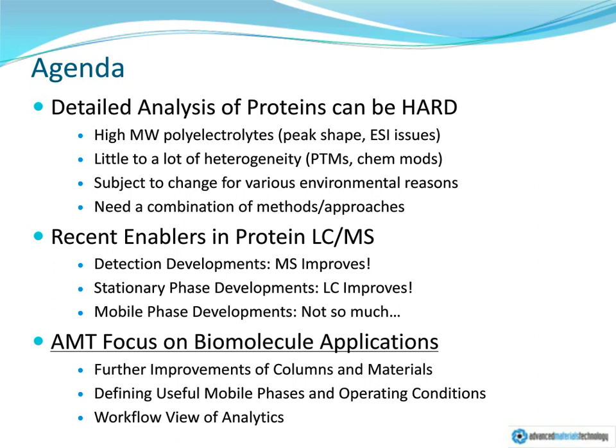But we have spent quite a bit of time and resource finding useful conditions or trying to expand the useful conditions for conducting separations for proteins and for peptides, as well as nucleic acids. We have, over time, developed more of a workflow view of protein bioanalytics, and we'll discuss that in some detail towards the later part of this presentation today.